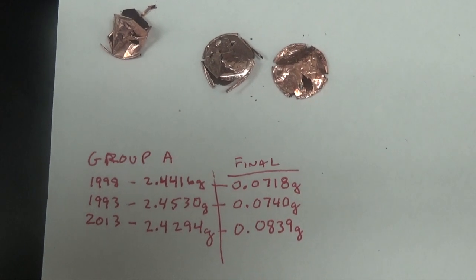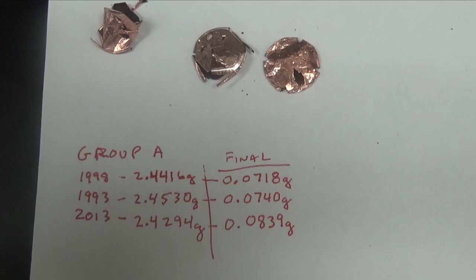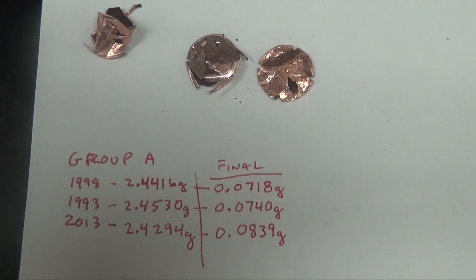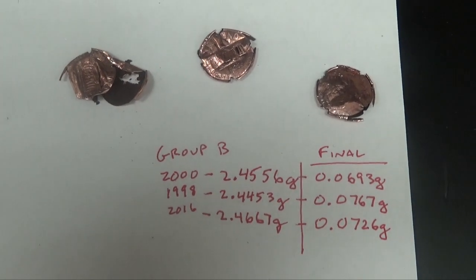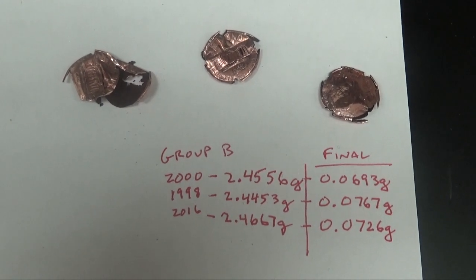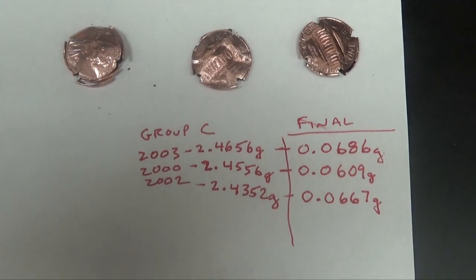All right, the remaining pennies have been weighed, so you can see their initial masses to the left and the final masses. This is group A. Group B and group C.